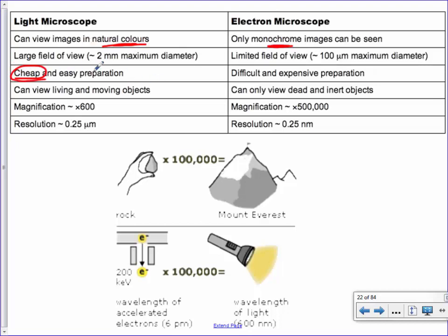They're cheap. Well, okay, I shouldn't say cheap. If you bust one of these, it's going to cost you a couple $100. But a couple hundred is better than a couple million. So please don't break the microscopes, by the way. Be very careful with them.